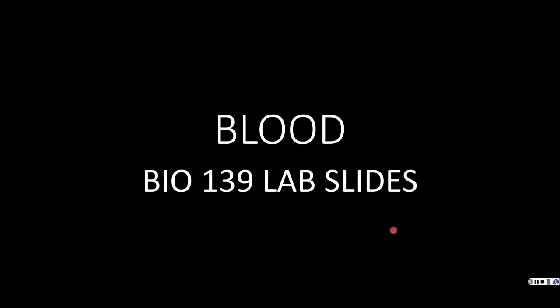Hi everyone. This is going to be a video walkthrough of the blood slides for Bio 139. These are the majority of the slides that will show up on Lab Exam 1 in Bio 139.